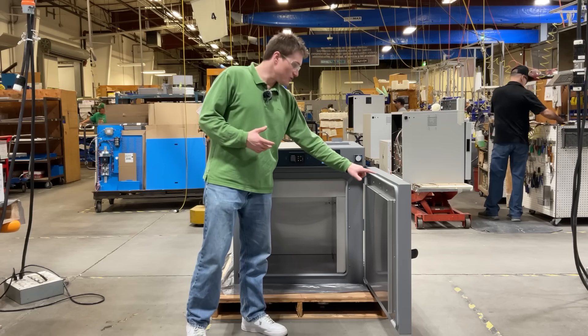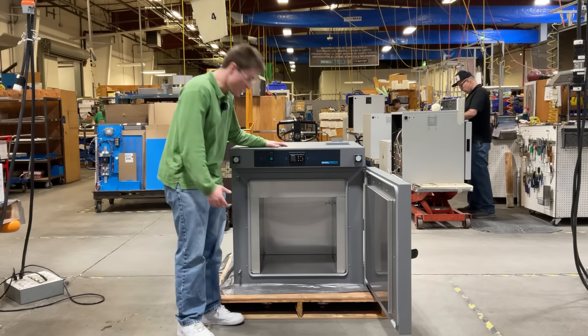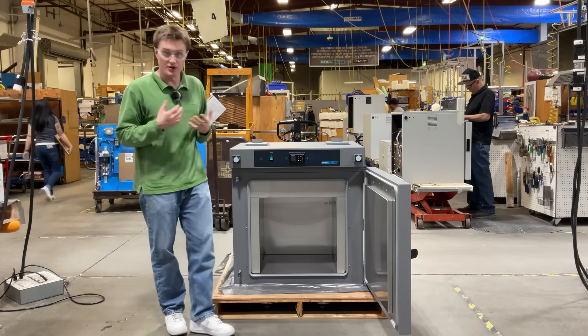Next, the double door gasket construction coupled with powerful forced air circulation and a unique hole pattern on the walls provide excellent temperature stability and uniformity while your unit is in operation.